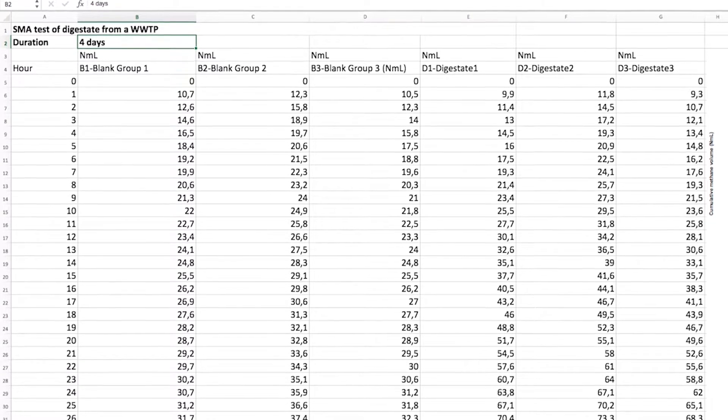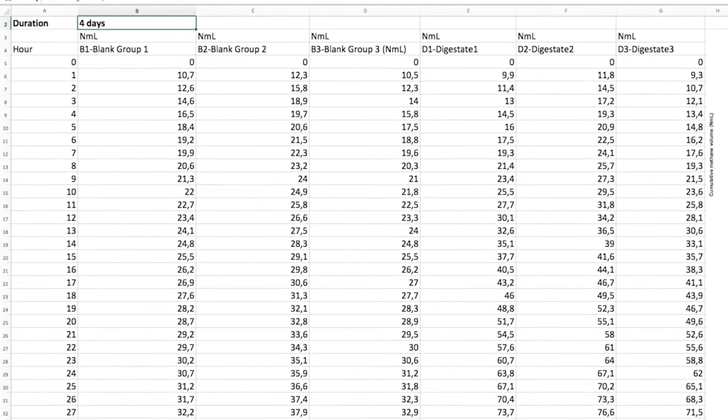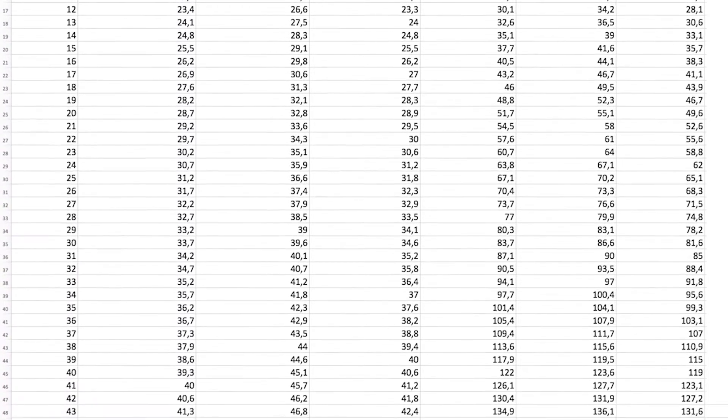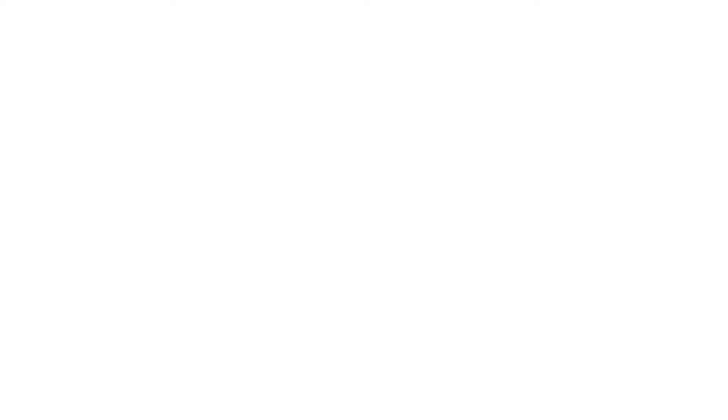After the test has been running for a few days, stop the program when the gas production stabilizes. Download the data from the program. To calculate the SMA of the sludge, use the data to draw the required graphics and carry out further data processing.